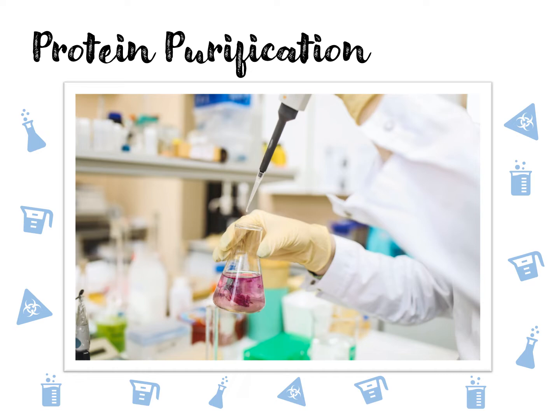So why was cell lysis important? A brief recapitulation. Because your protein of interest will be expressed by the cell and will be residing within the cell. So in order to release this protein from within the cell, it is imperative to lyse the cell.